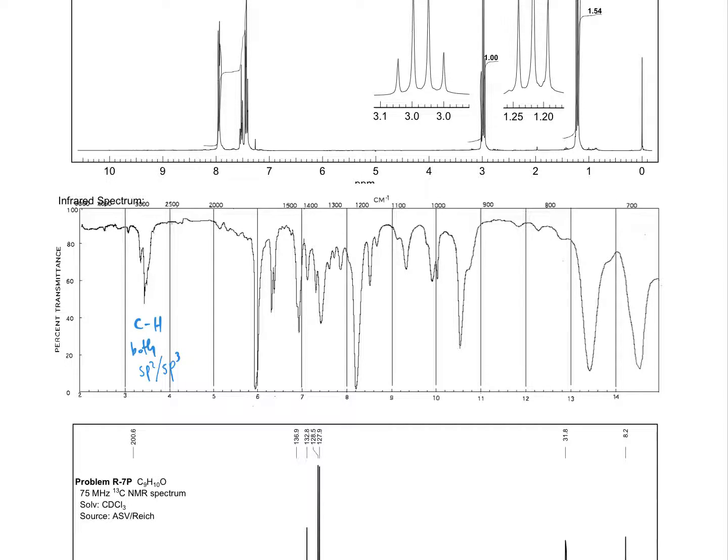What we can tell is that we have no OH, and we have no carbon hydrogen bonds on alkynes, because that would show up at like 3300 and so on.